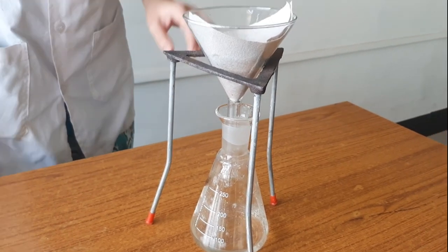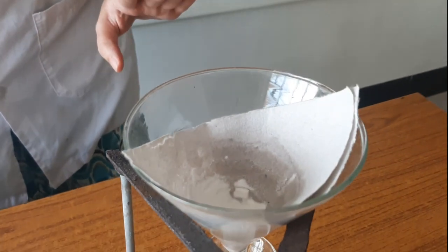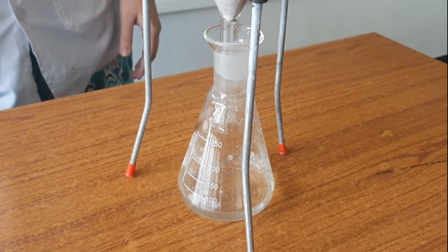So now as you can see here, we have obtained the last drop of the filtrate, and now we are at the end of 6 minutes and 47 seconds.